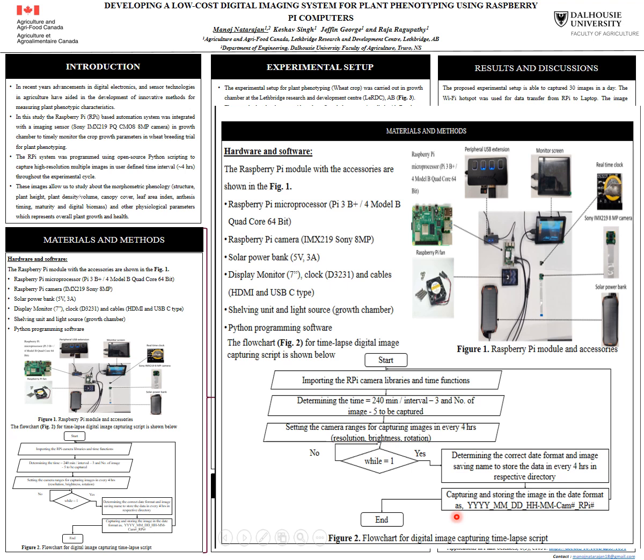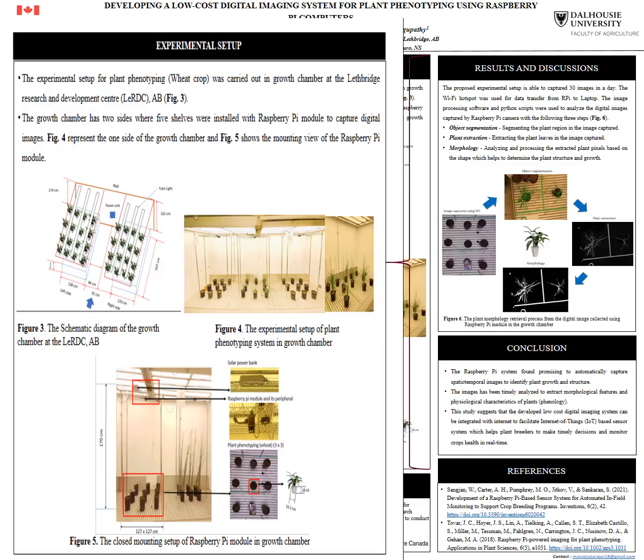The camera system was scheduled to power on automatically through the power management system. Similarly, the time-lapse imaging script ran automatically using the Linux crontab schedule. In this study, the camera was controlled and the time-lapse script was run at 6 time points each day. Therefore, for 1 cycle at each time point, the sensor system was set to power on before running the script for 15 minutes and power off after running for 15 minutes to ensure all the operations are completed. Moving to experimental setup.